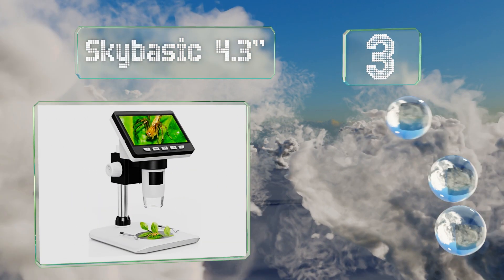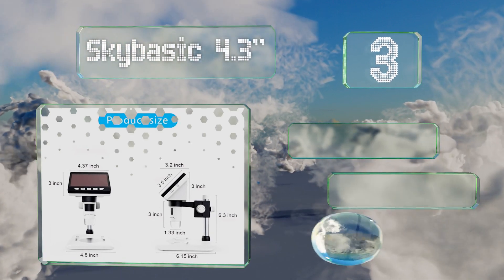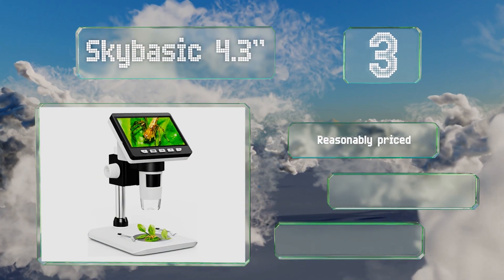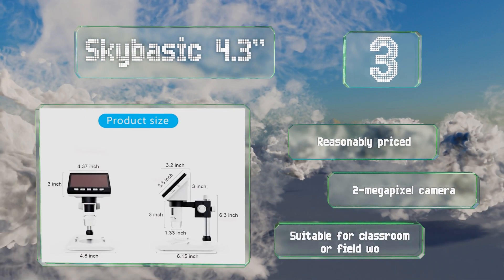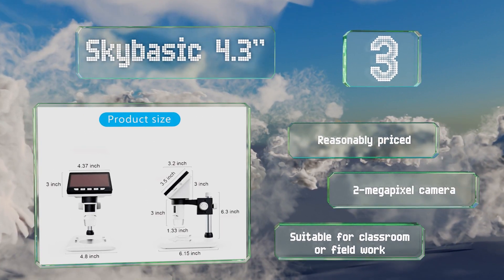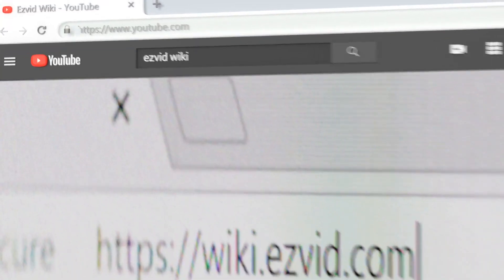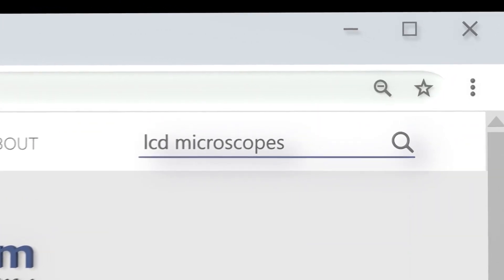Nearing the top of our list at number three, the Sky Basic 4.3 inch has a high definition display with adjustable LED lights. You can save images to a Trans Flash card and also connect it directly to a PC to view the video feed. It's reasonably priced with a two megapixel camera and is suitable for classroom or fieldwork.